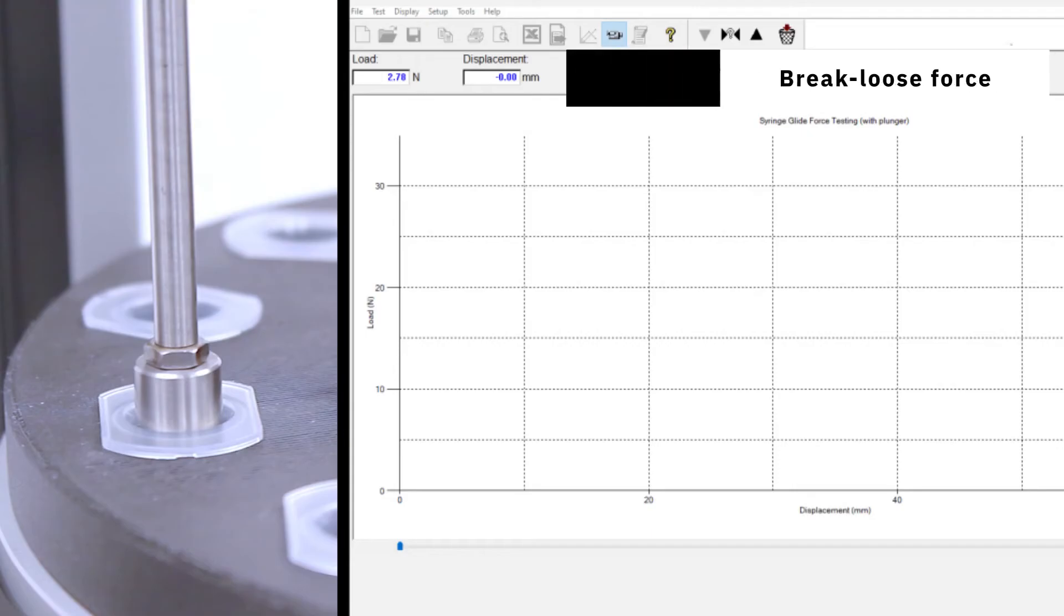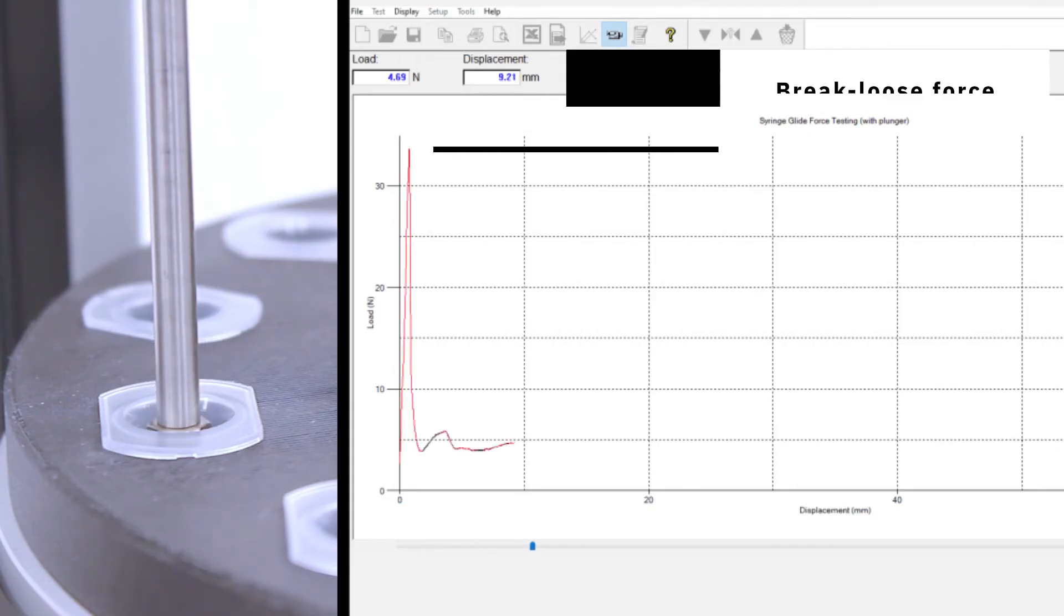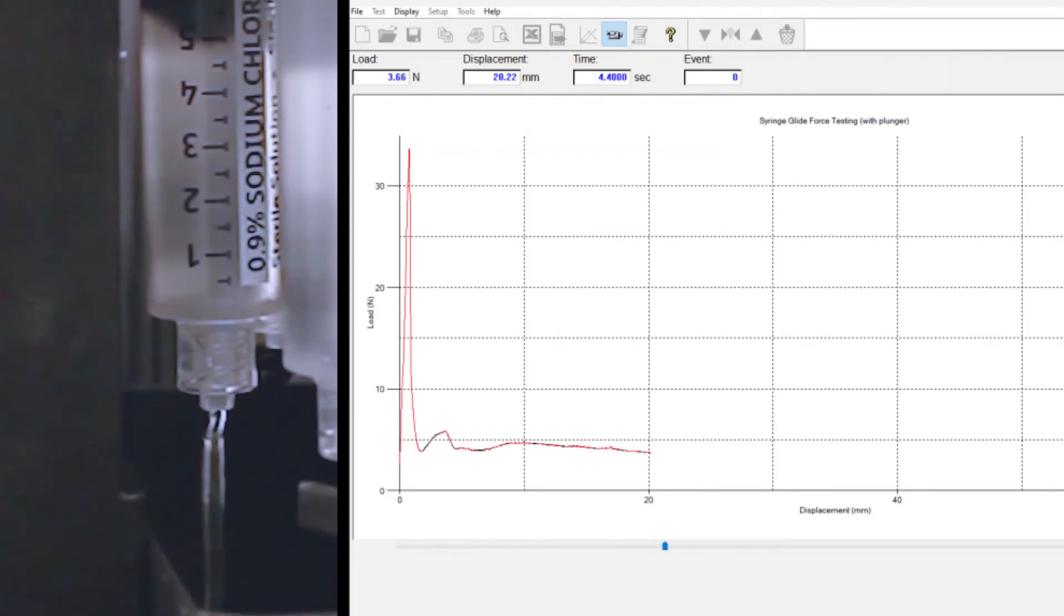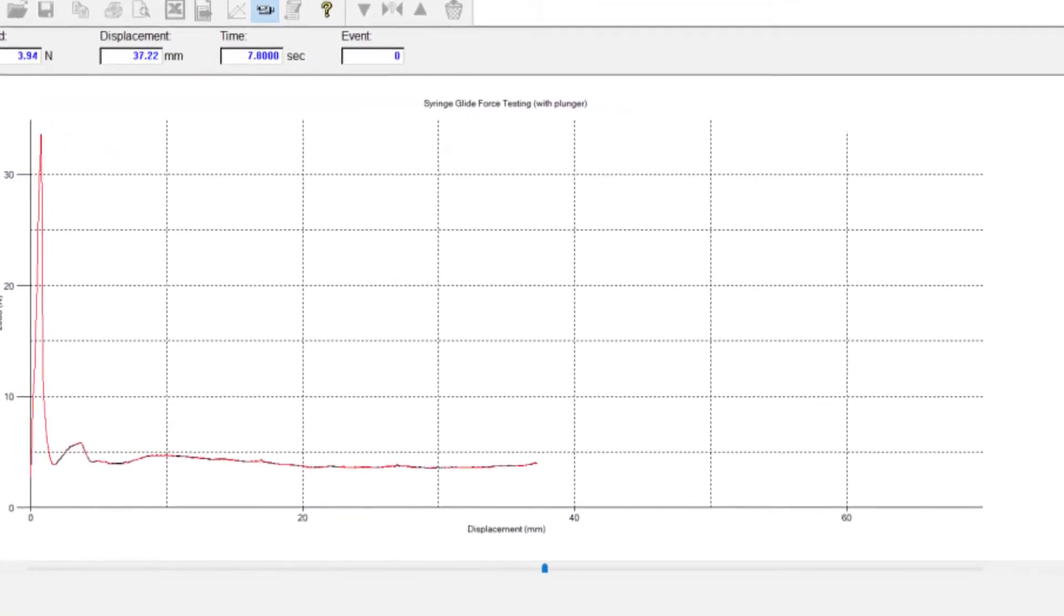It approaches the top of the syringe, touches on lightly and sets a reference point for the test, then compresses the plunger rod by a set distance and measures the forces it exerts.